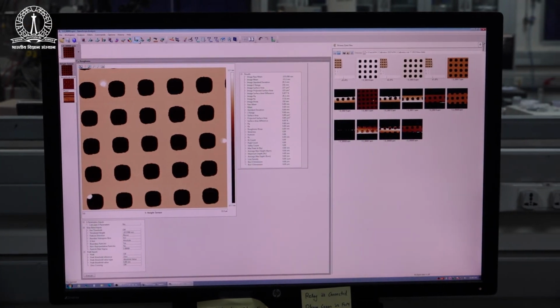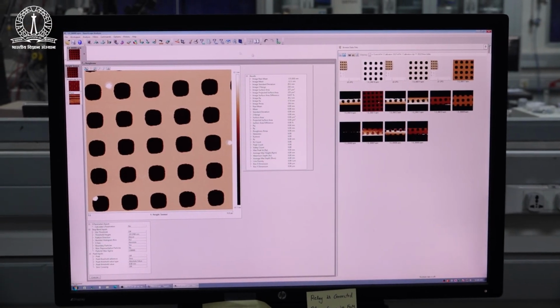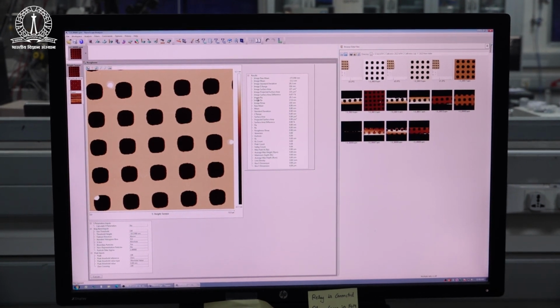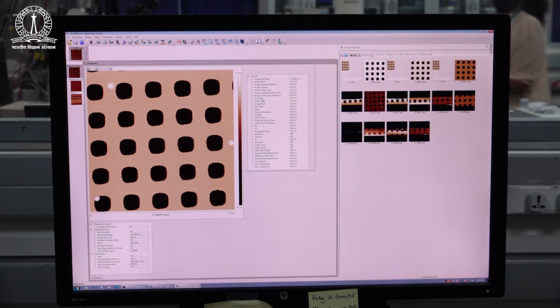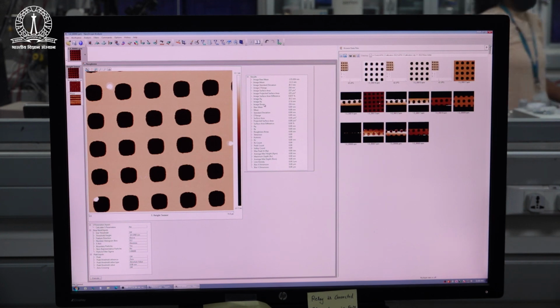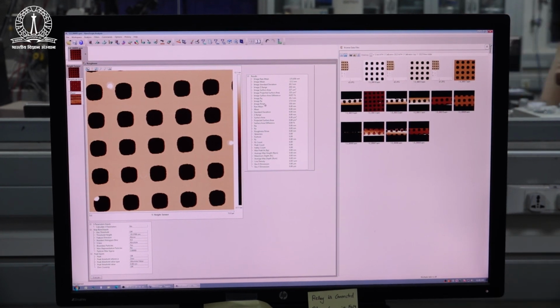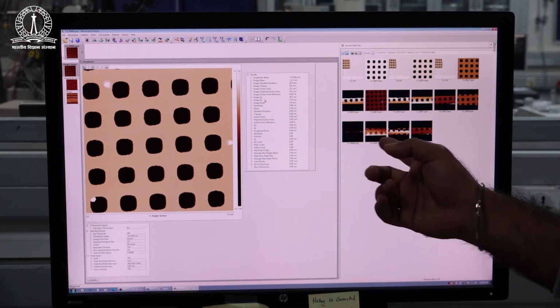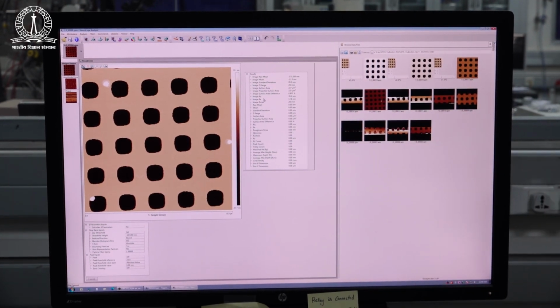This is not the right image to show that, but in the image roughness table, the results table, for roughness factors, you need to look at image RQ. RQ stands for RMS roughness, that is root mean square roughness, and RA stands for arithmetic mean, that is average. So if the image is right, you can look at all those data points.